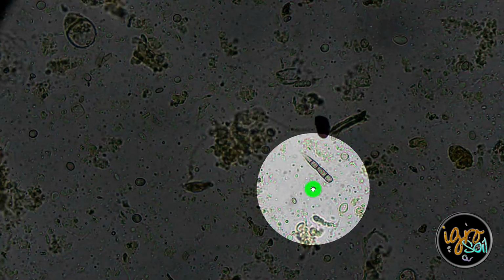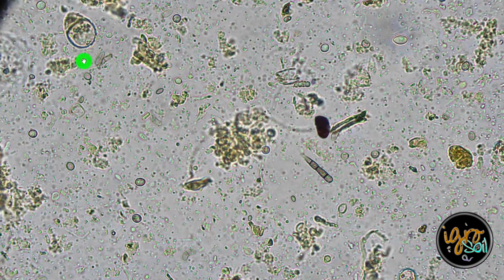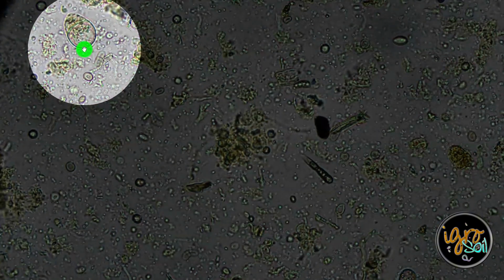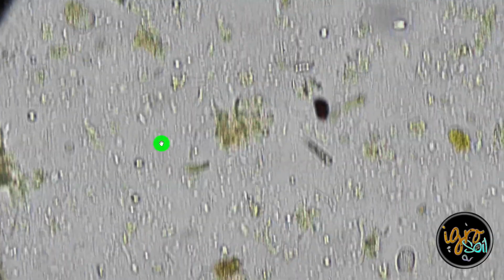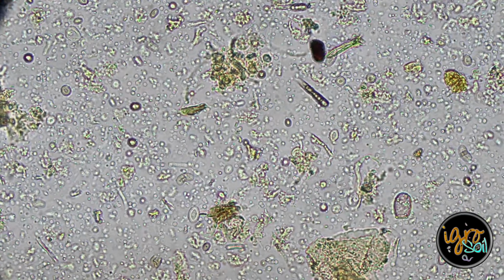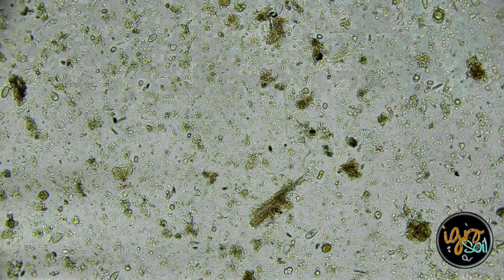That is a good-looking spore there that is growing, sporulating. Or look at this amoeba. This is another test state up here. And again, I'm going to talk about the diversity in them, right? Because we want that from one to the next. Here, look at this one here. Look at the difference, right? So yet another type of amoeba. There are spores everywhere here. Okay, there are tons and tons of spores.